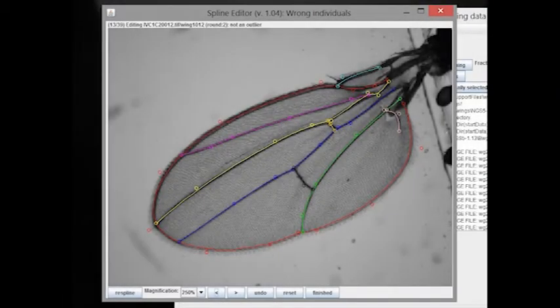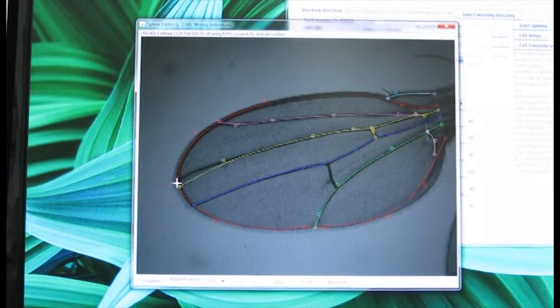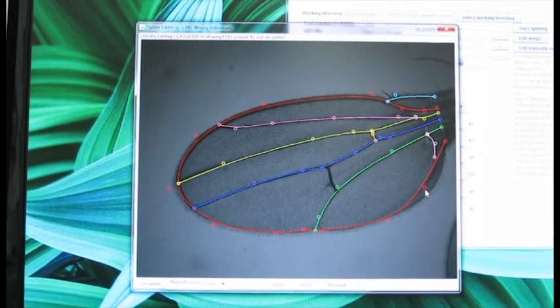These models are called splines. Usually, splining accurately summarizes the wing. Splining is not always perfect, however, and WINGS makes it easy to detect and correct errors by hand.